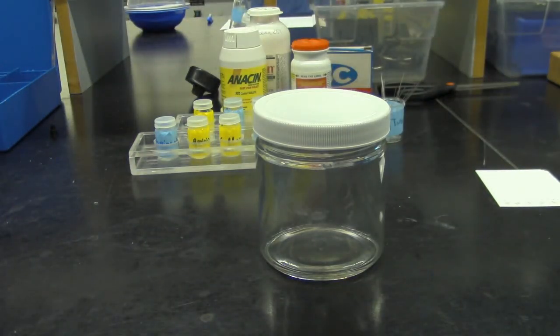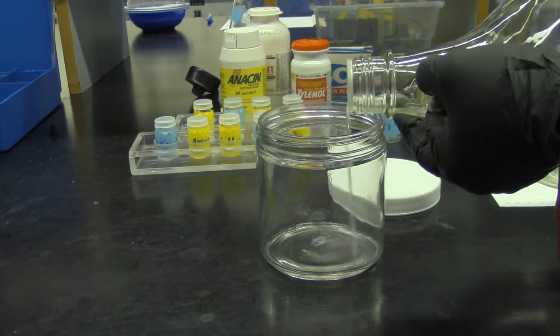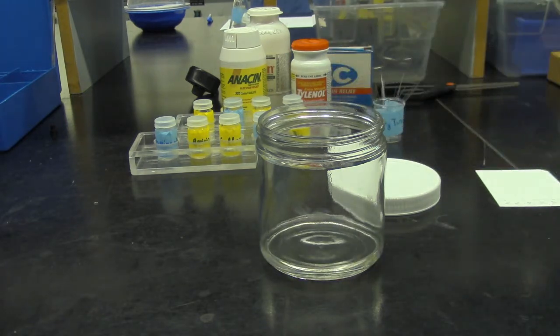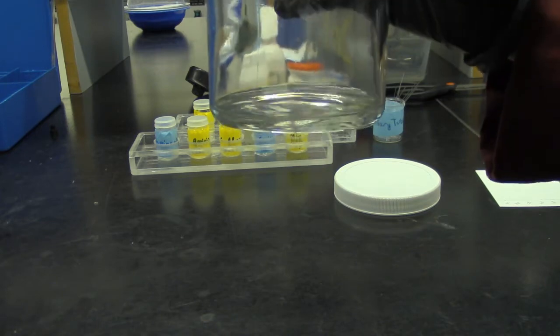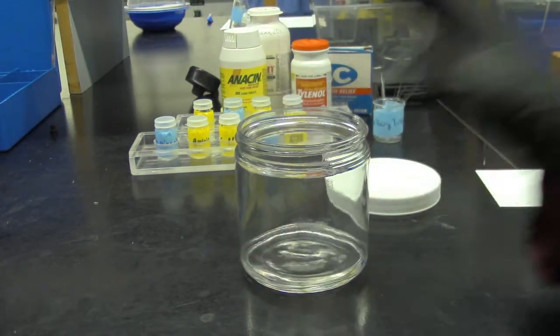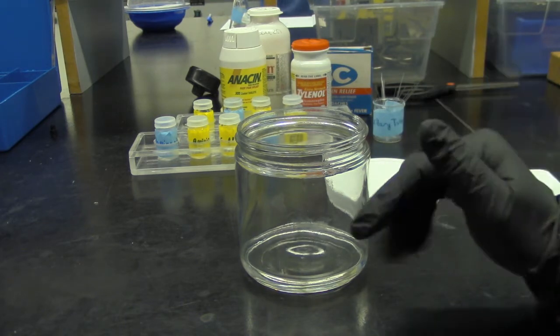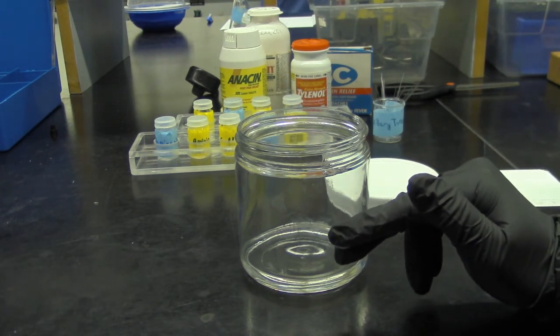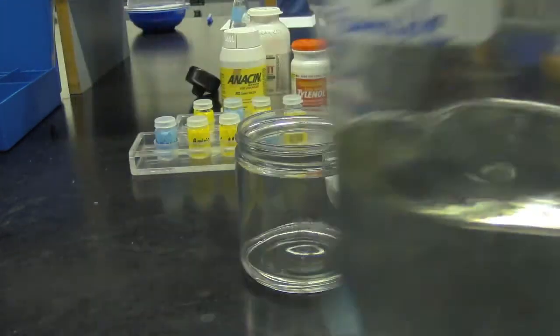So I have a big jar here. So I'm just going to pour in about 10 ml just to cover the bottom, right? You don't want to add too much because remember your TLC plate, all the spots are just 1 centimeter above the plate, right? So if the solvent is too high, then all the compounds will just flow backwards instead of capillary action rising to the top. You want that. And so if the solvent is too high, it will just redissolve and get dissolved into the solution, which is mobile phase, right? So this solvent is called the mobile phase.